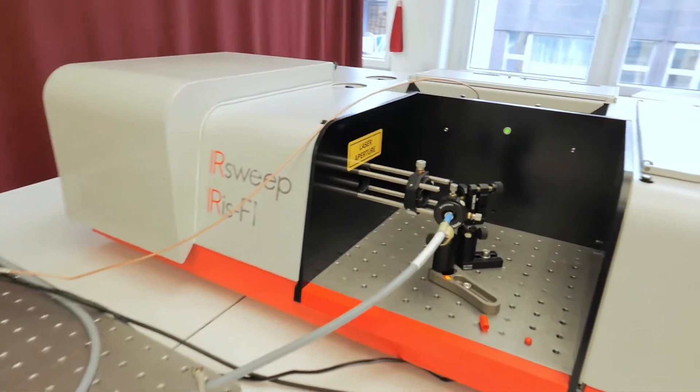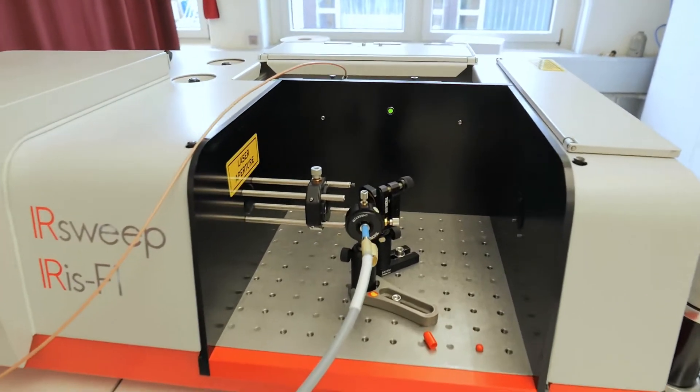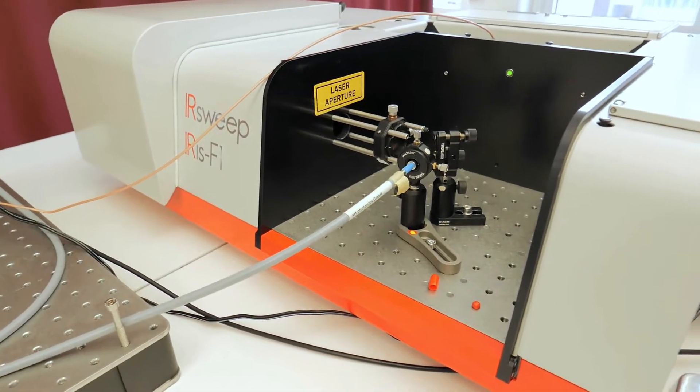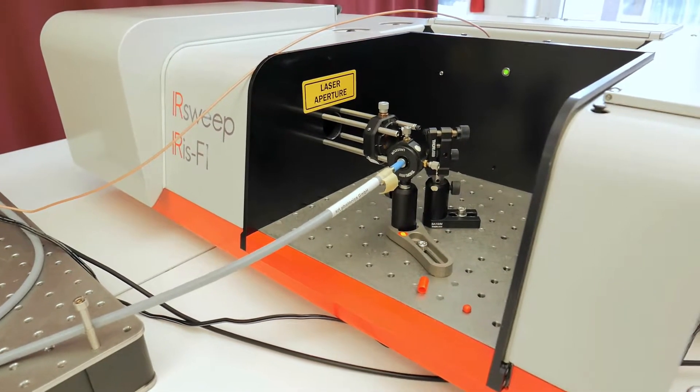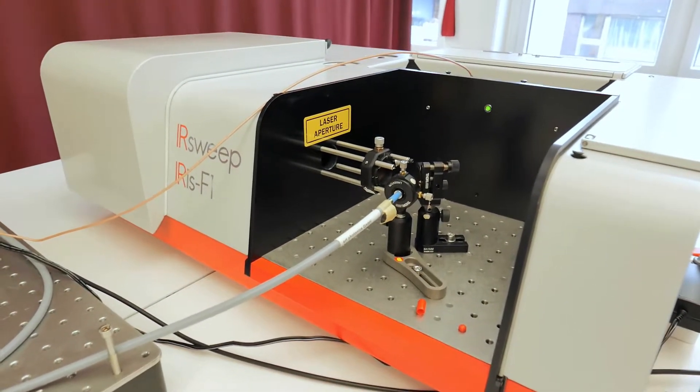You can see we have here our Iris F1 mid-infrared spectrometer and it's coupled with a rather long fiber from Art Photonics in Germany. This is a mid-infrared fiber and it's currently one of its kind.